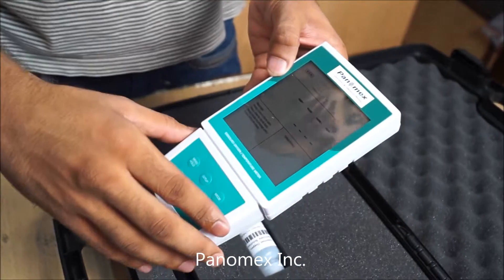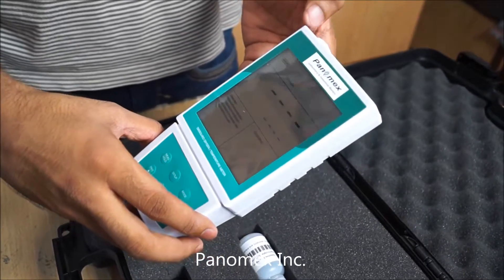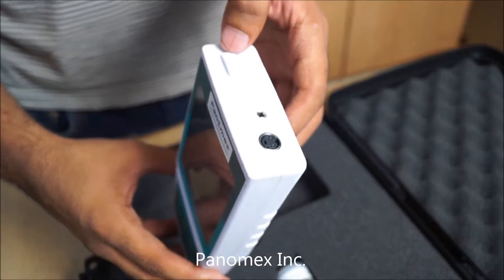The meter will turn on, and you can turn it off by doing the same thing.